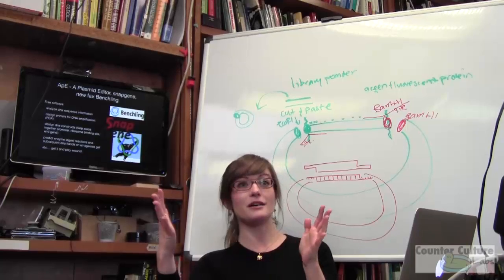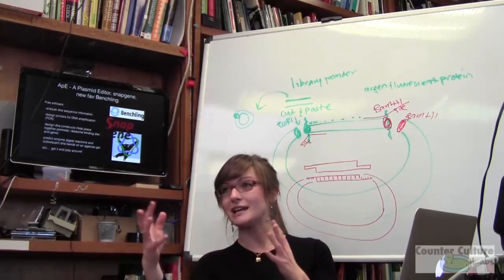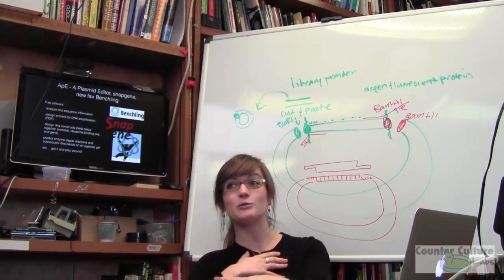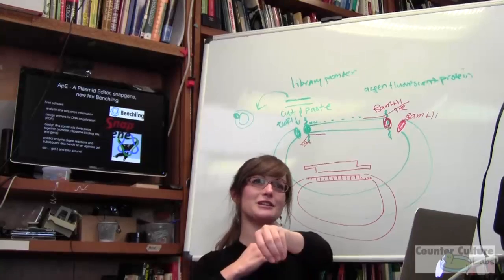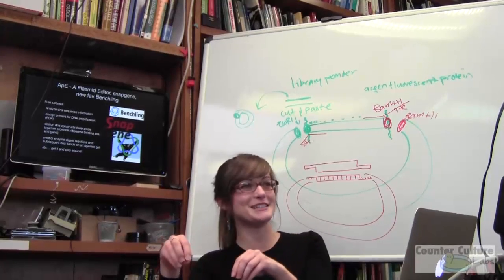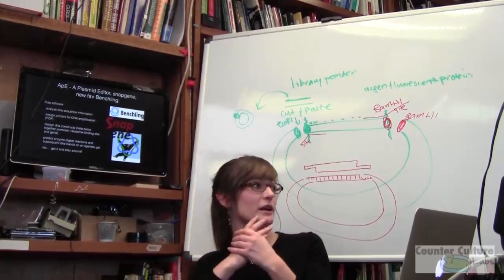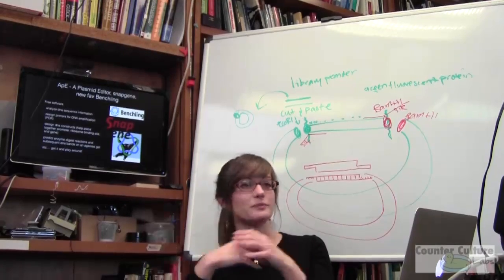we keep Google Docs of everything, and everyone has their own Google documents of their DNA files and things of their DNA. And every oligo that I get synthesized, I have my own personal Google Doc that other people can see, but maybe they need to use a primer and they just don't want to feel like digging through my stuff because it's going to be really difficult to figure out my annotation. So they reorder something very similar. And then you end up spending more money than you need to. So Benchling is great, so you can make these shared oligo repositories and scan them. It's very nice.